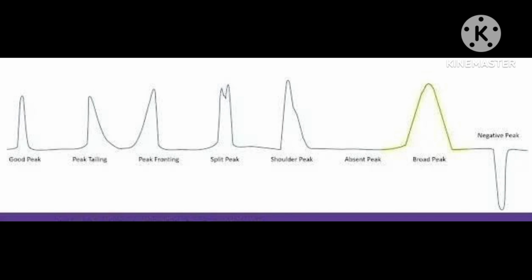In this video I will discuss broad peak and negative peak. Let's discuss without any delay. Let's start the session.